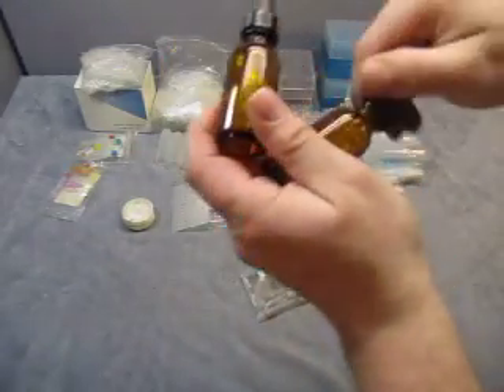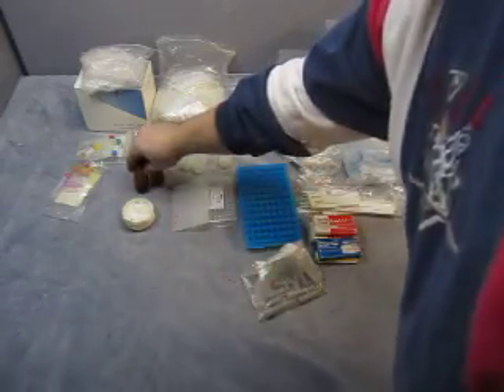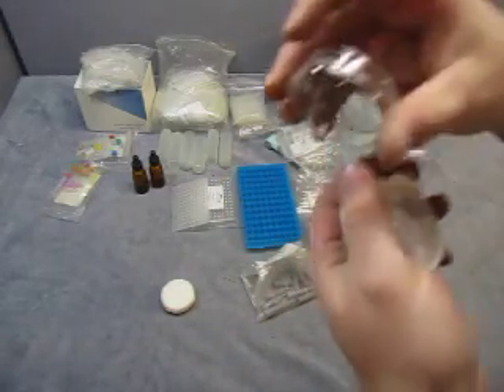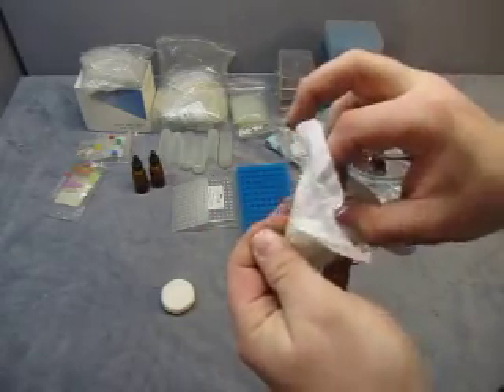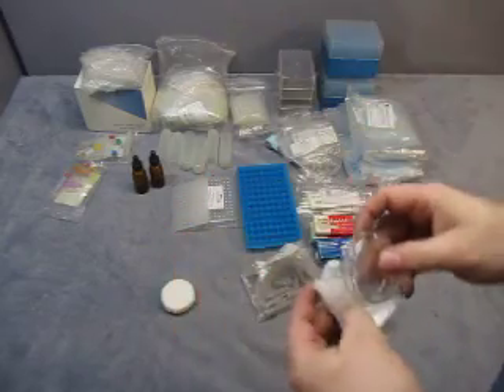Then you get two little dropper bottles — little droppers, brown colored glass. And then there are some Pyrex items — a Pyrex bottom and a cover, so like a little petri dish or something. You get two of those.